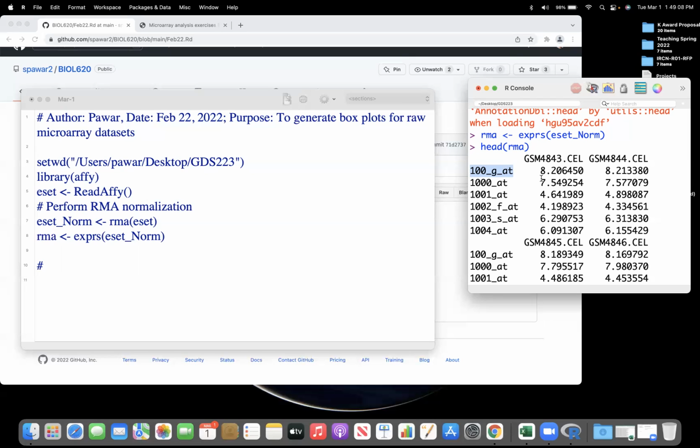So I'll have a threshold here and a threshold here. Say my thresholds are -2 and +2. Anything above +2 is interesting, and anything below -2 is interesting. Those are the interesting genes which we want to look at. That's all.